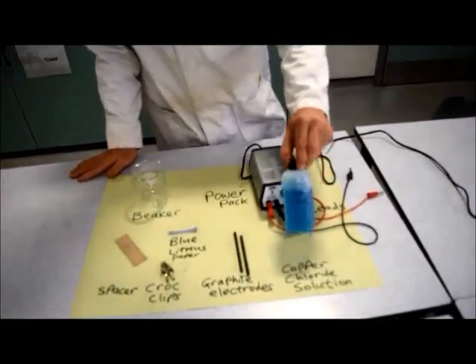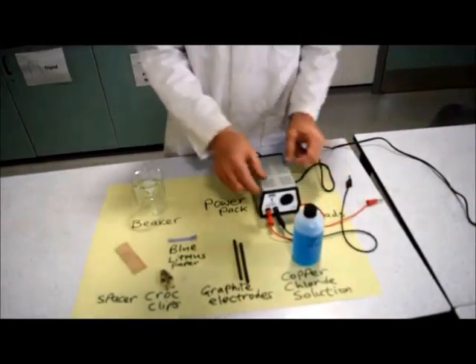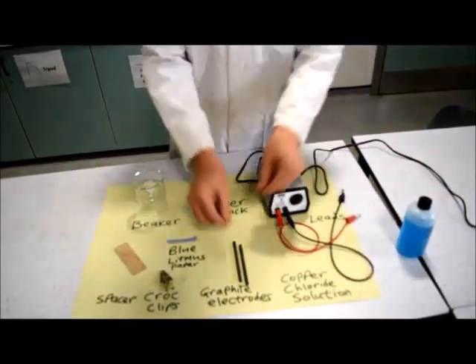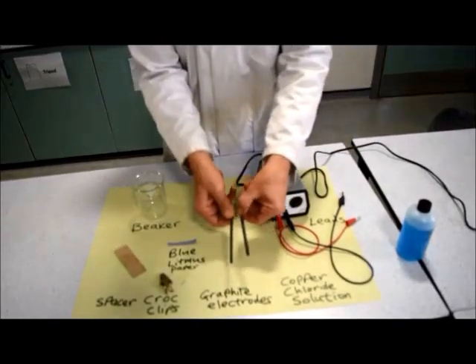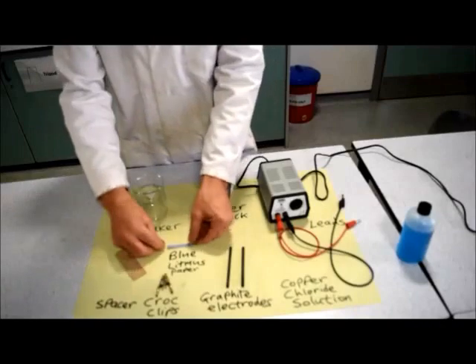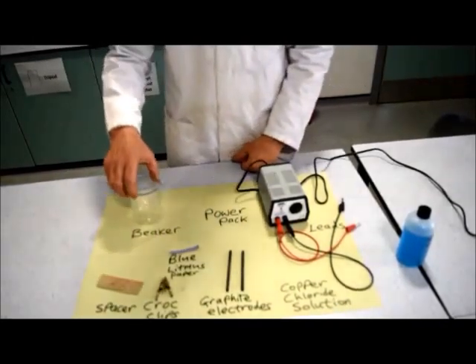This is the solution of copper chloride—it's a blue solution. We're going to need a power pack, two graphite electrodes and two crocodile clips, some blue litmus paper, a spacer, and a beaker.